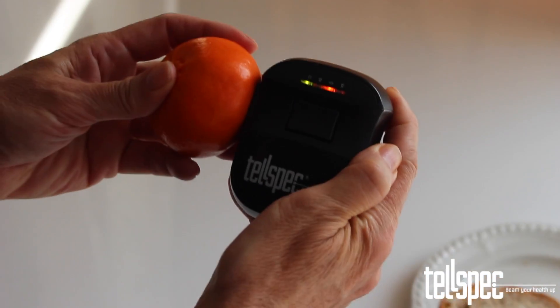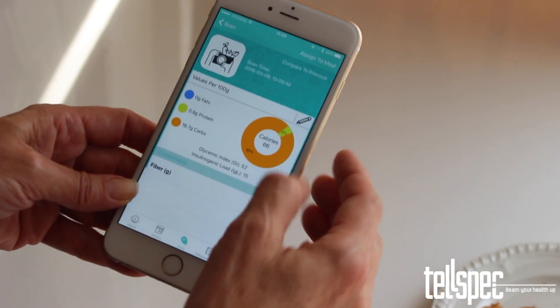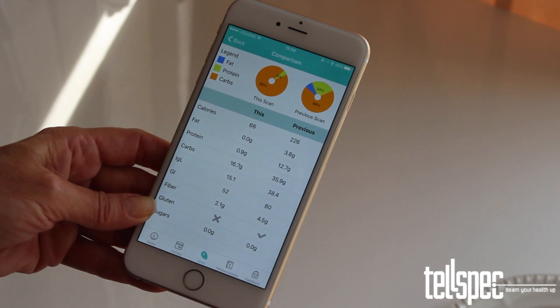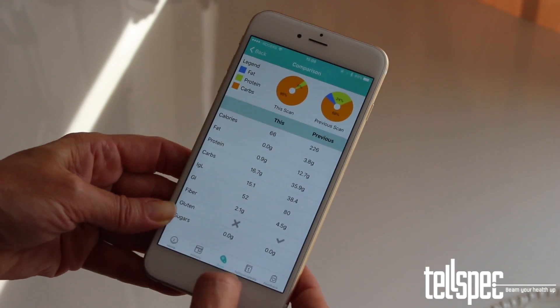If you perform multiple scans, a new button appears on the top right hand corner of the analysis screen that says Compare to Previous. When you tap this, the current scan and the previous scan are displayed side by side for comparison.